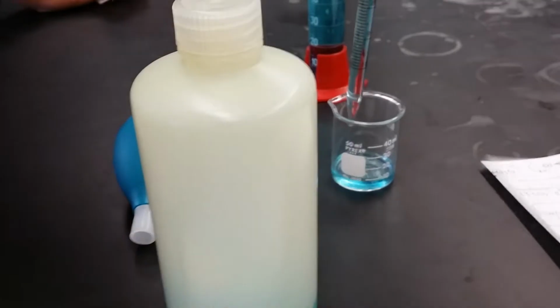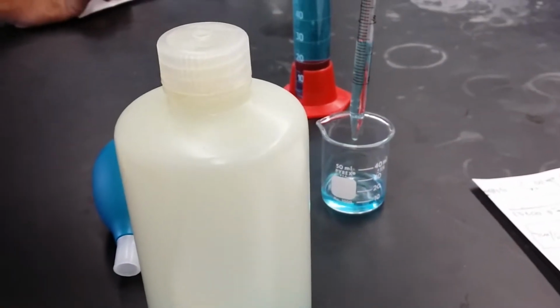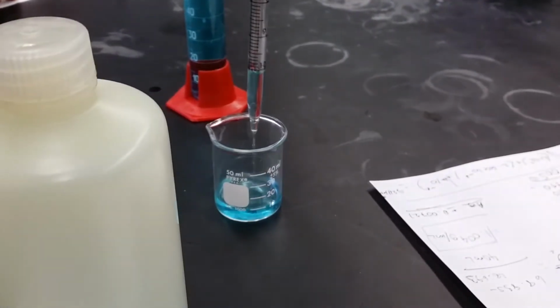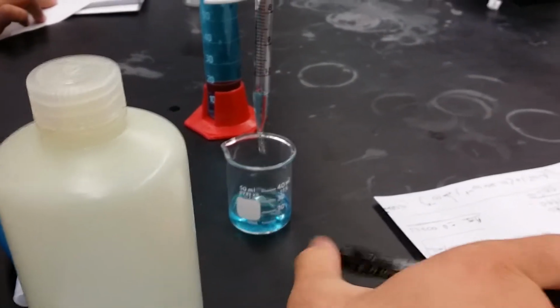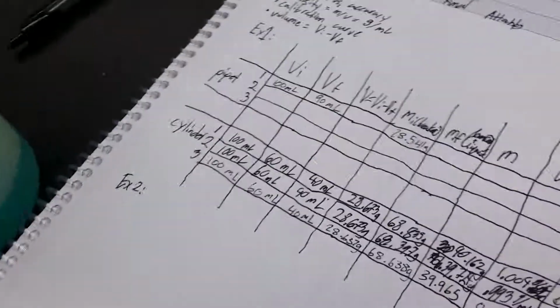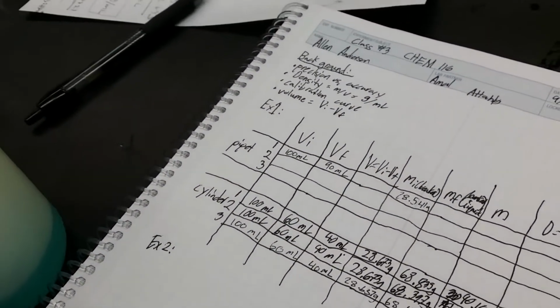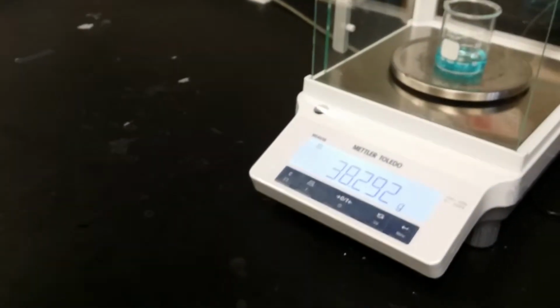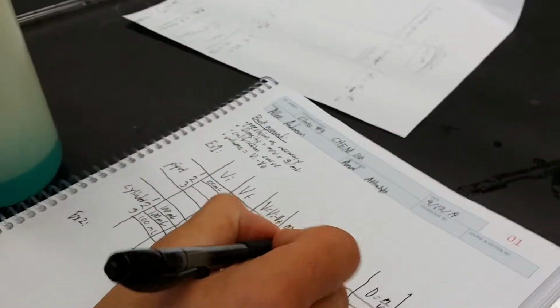So over here we gotta write down the volume initial, which is 100 milliliters, and then the volume final is gonna be 90 milliliters. Alright. And then we go see how much this weighs right now. And it is 38.292.